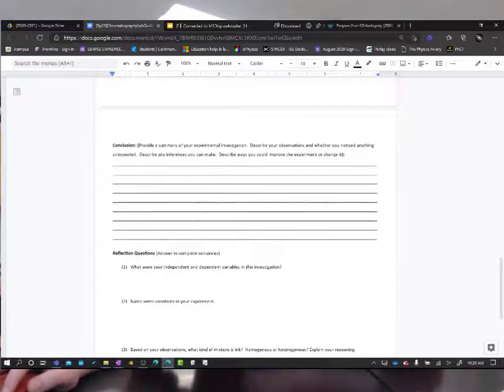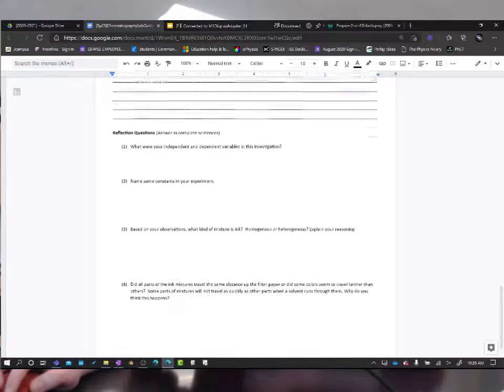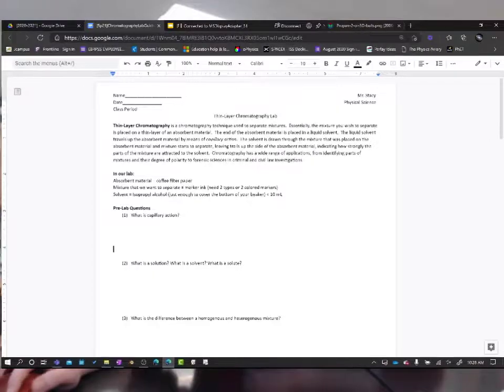There's a lot you can put in here about how you could try to take this experiment or investigation in a different direction, and then answer the reflection questions at the very end, and that'll be all. All right, and make sure you read the beginning and answer the pre-lab questions before we get going.